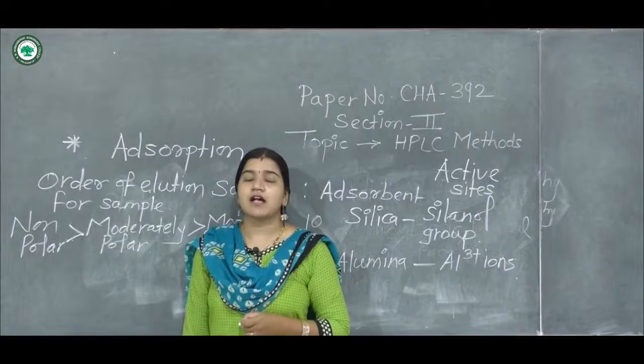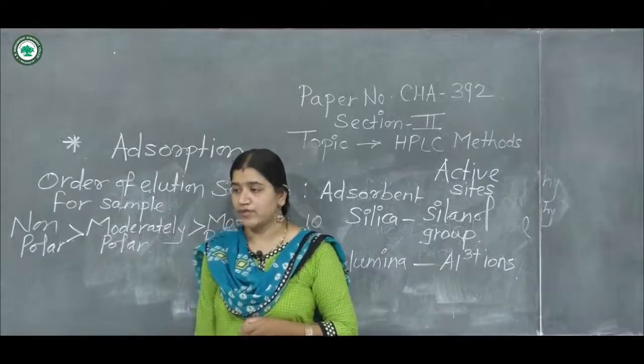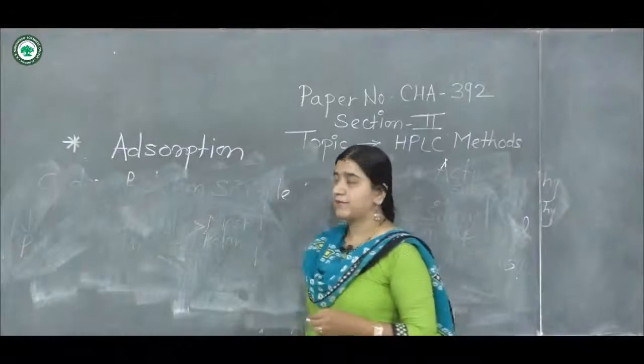So what are these interactions that take place in adsorption chromatography? The first one is the dipole-dipole interaction.